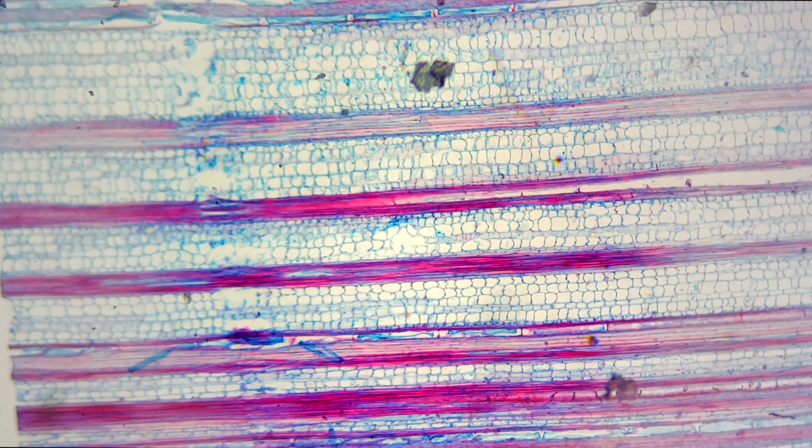Now I'm switching to another specimen. This is the corn stem.